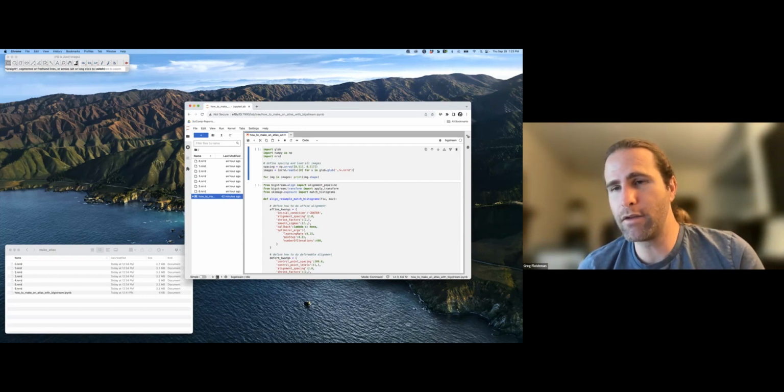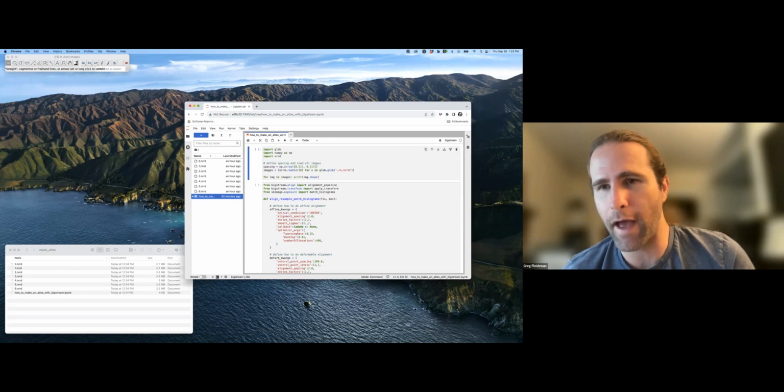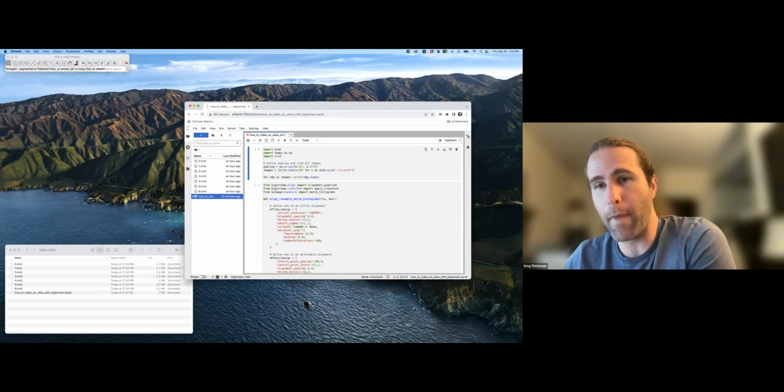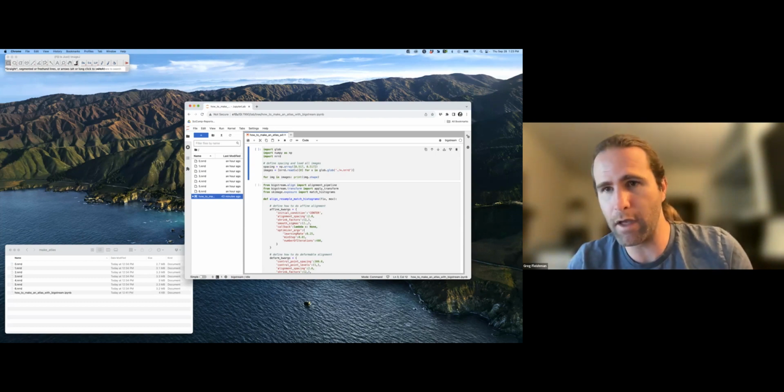So all of a sudden you get some values that shouldn't have originally existed in your data. Most of these histogram normalization and histogram matching algorithms force a floating point value bit type. A lot of the data we collect is integer valued, but scikit-image histogram match and scikit-image histogram equalization both convert the data to 32-bit floats first.